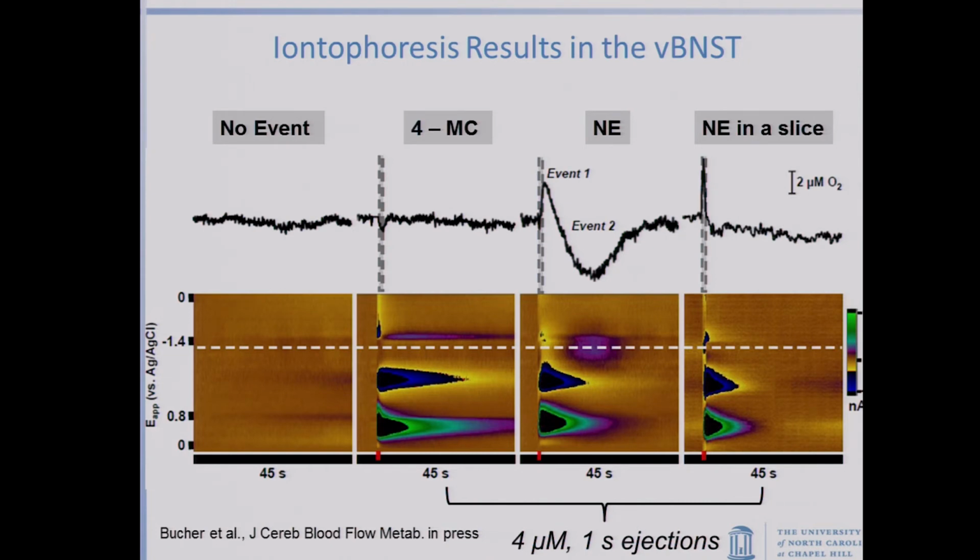Okay, so what I've tried to do here today is show you how we've taken this electrochemistry, made it into a sensor for neurotransmitters and metabolites, added single-unit electrophysiology, added what we call controlled iontophoresis, because we have these electroactive markers here, and it gives us a lot more capability of unraveling what neurotransmitters are doing during behavior.